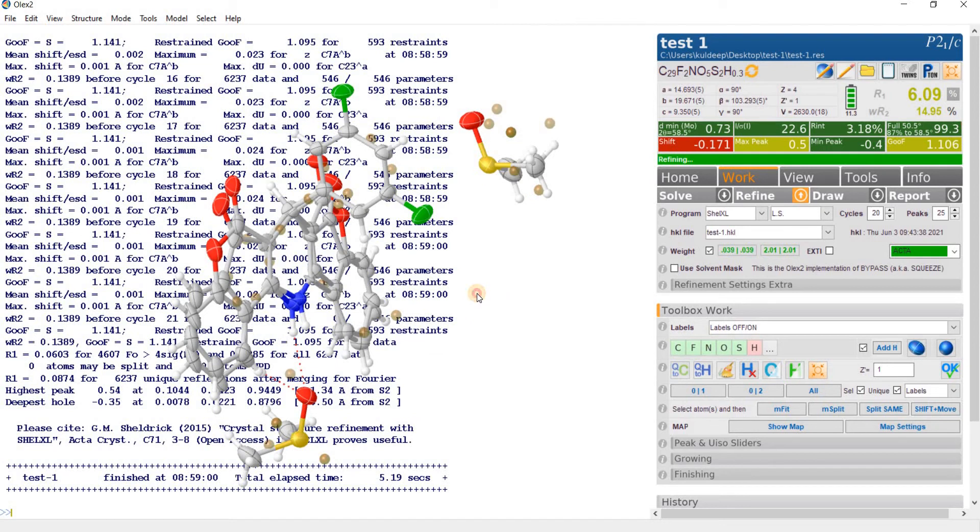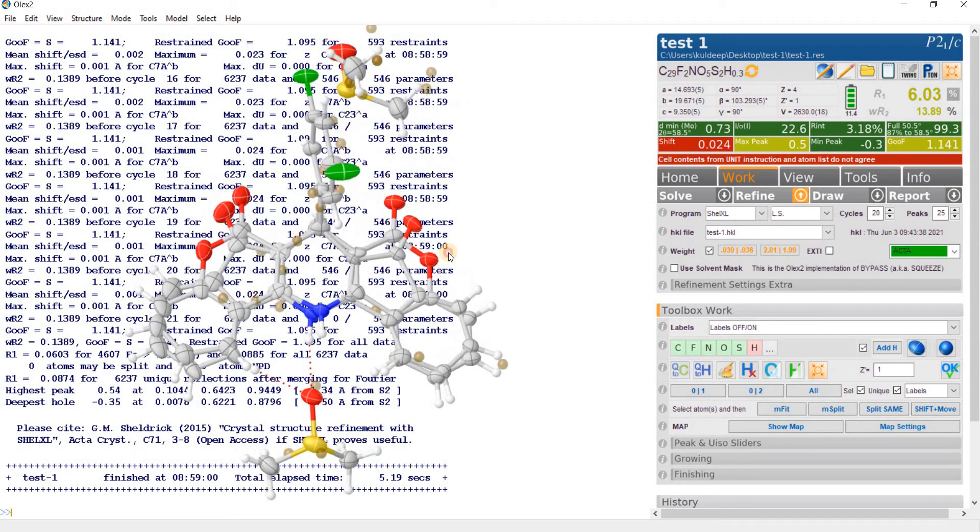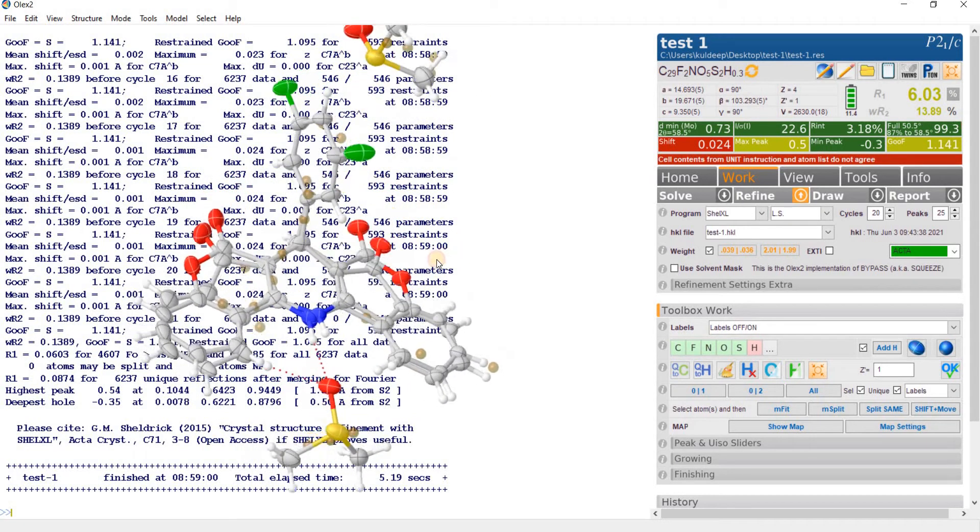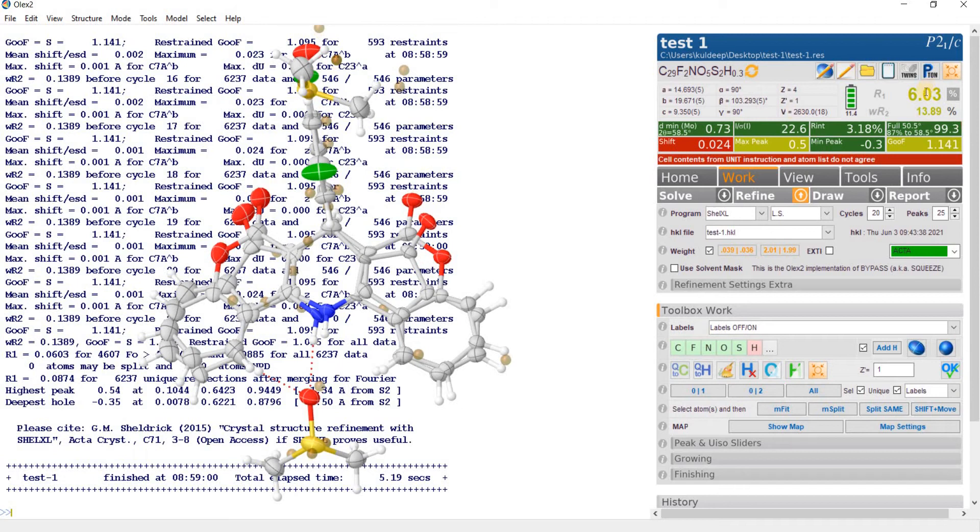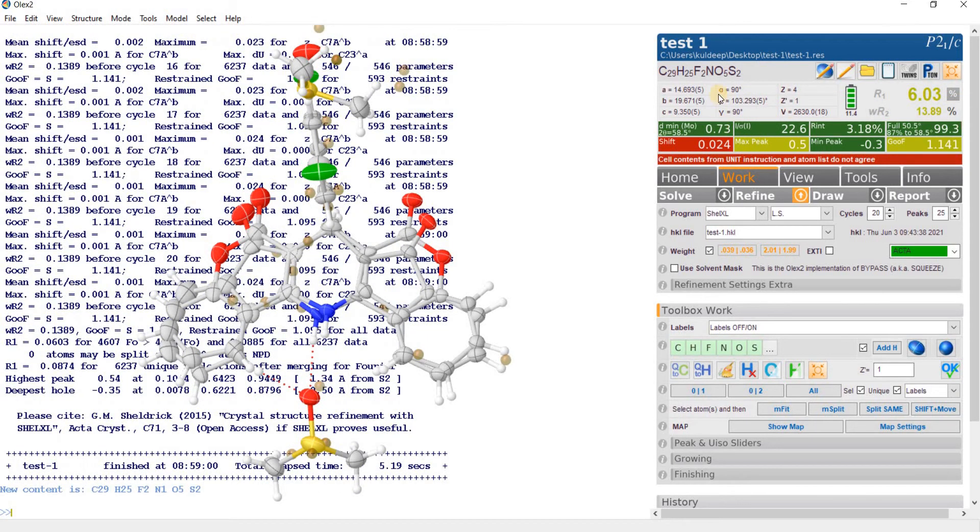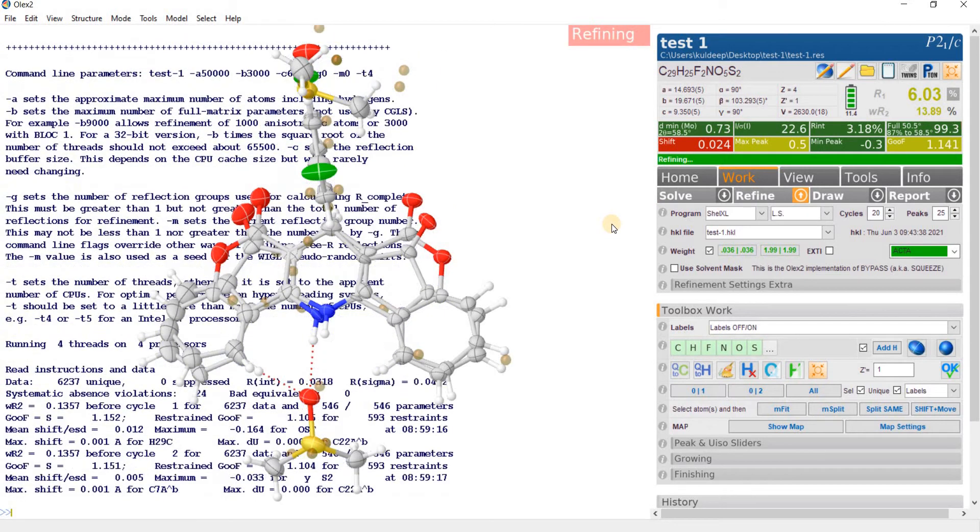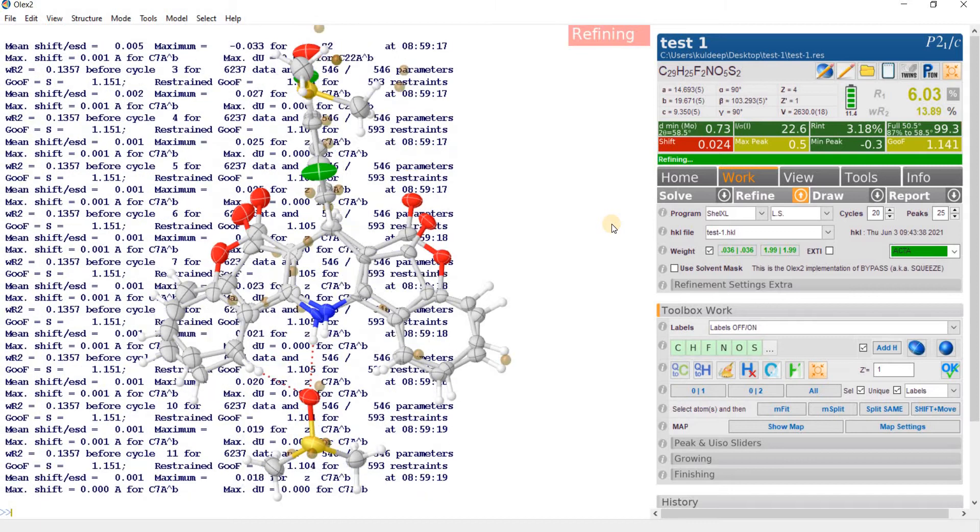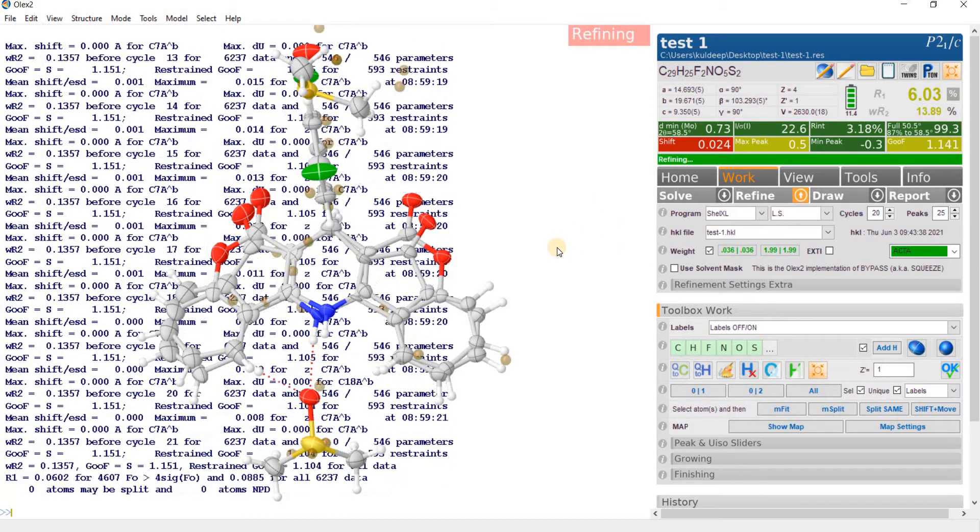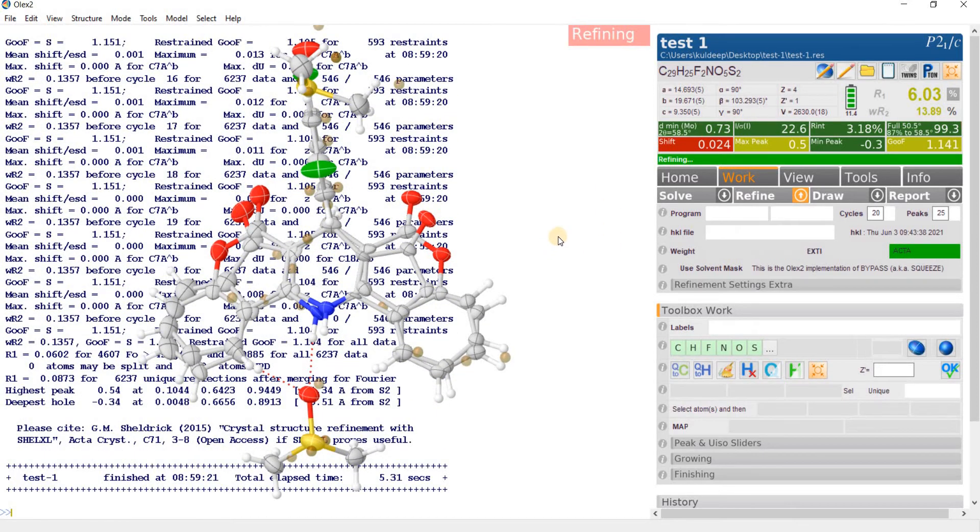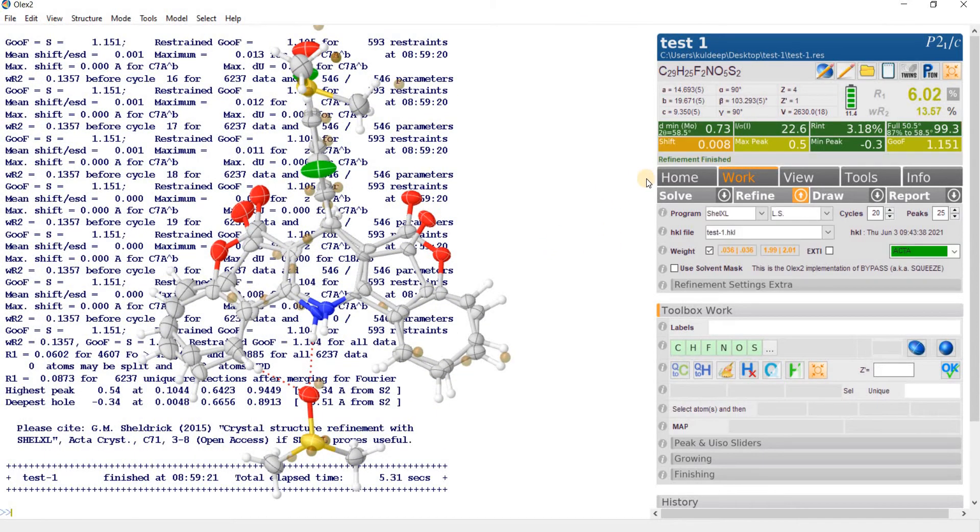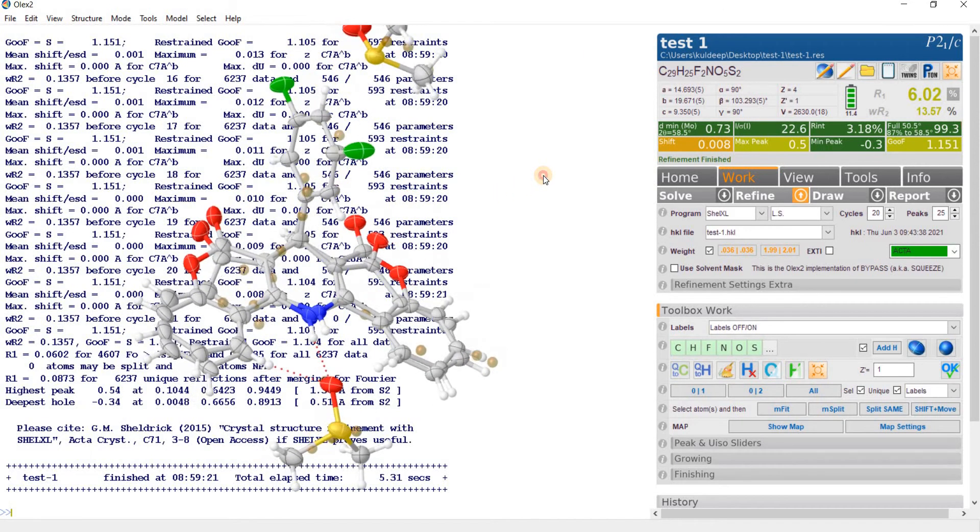So now every atom is behaving good and the R factor is around 6.03%. Refine one more time so the shift gets stabilized. Now everything seems good, refine one more time.